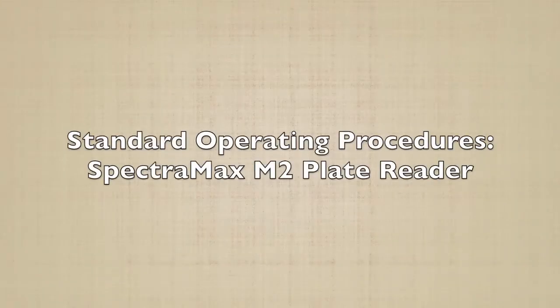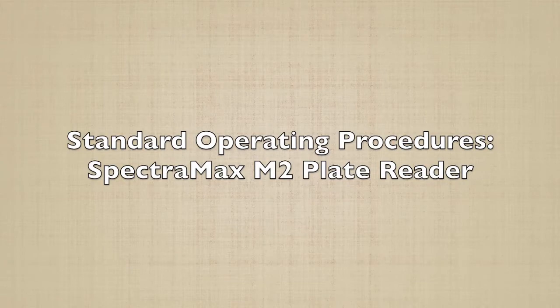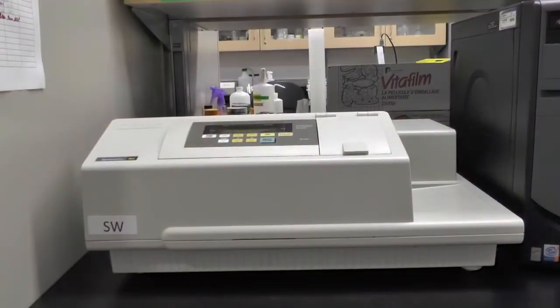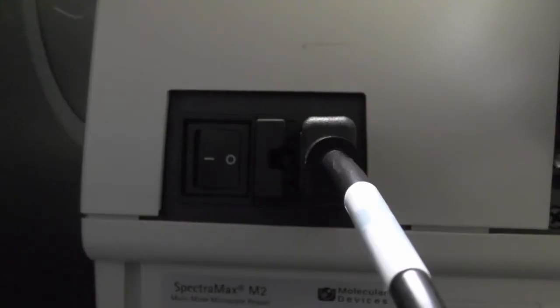This video will show you how to use the SpectraMax M2 plate reader. To turn on the machine, switch the power button located on the back of the machine to the on position.